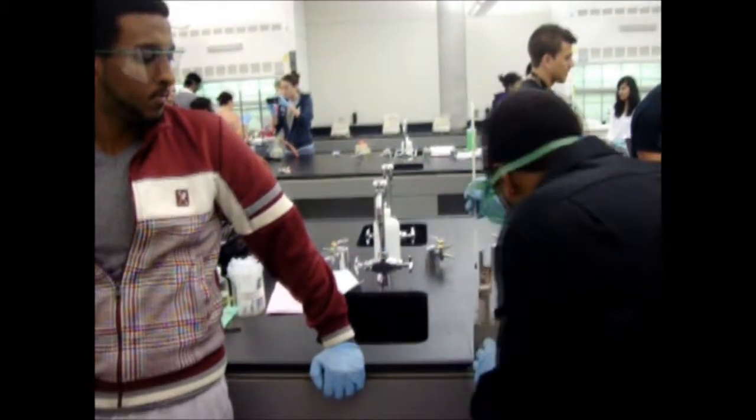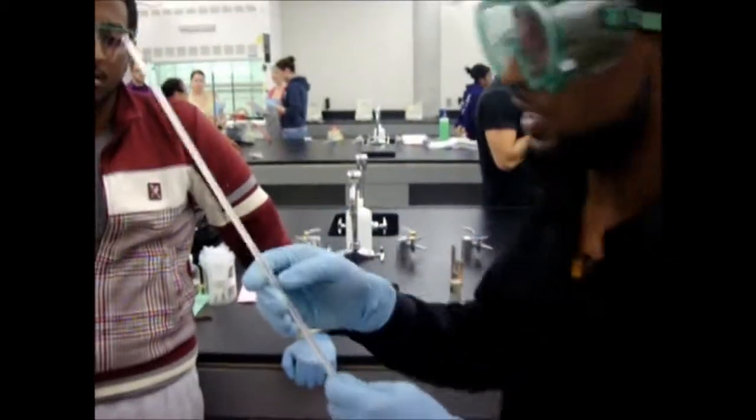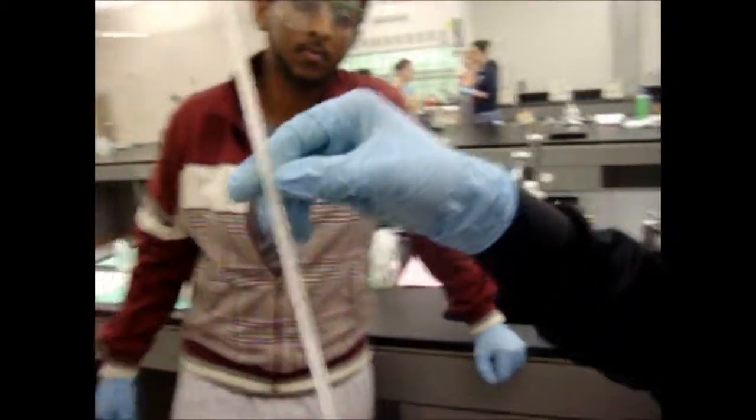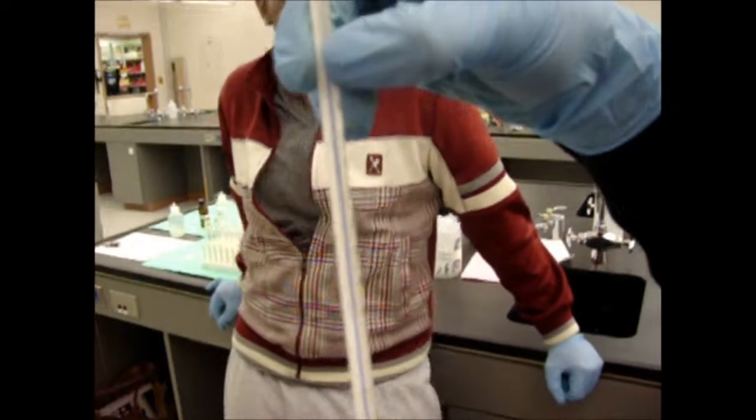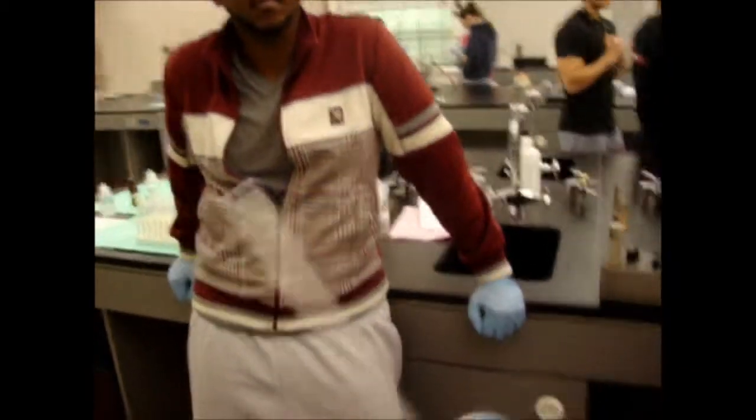Now that we have identified when our solid was liquid, we have to see what range of temperature that was. Now we can see that it was around 66 degrees, around 66, 67. So 66.4 was the actual melting point. So yeah, we got it pretty close. We're off by 0.5 degrees, which is a good indication that we did the melting test right.